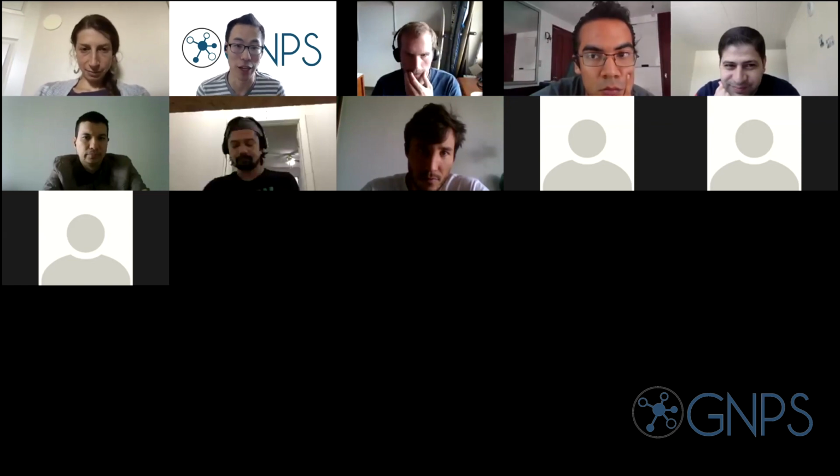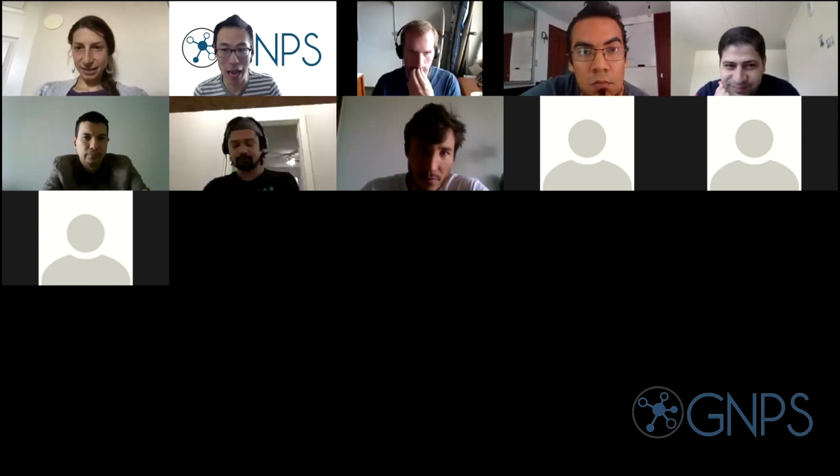So if you want to try that out, let us know. That's all in beta, and it's on the tool index. But beyond that, we're also working on auto-tuning these things. So hopefully it'll get easier in the future. But as it is right now, in terms of being realistic, there's nothing that really replaces you spot checking it. But I'm a computer scientist, and I don't want you to ever do any work. So that's kind of a look ahead. But anyway, Danny will organize the breakout sessions and we're happy to answer any questions.